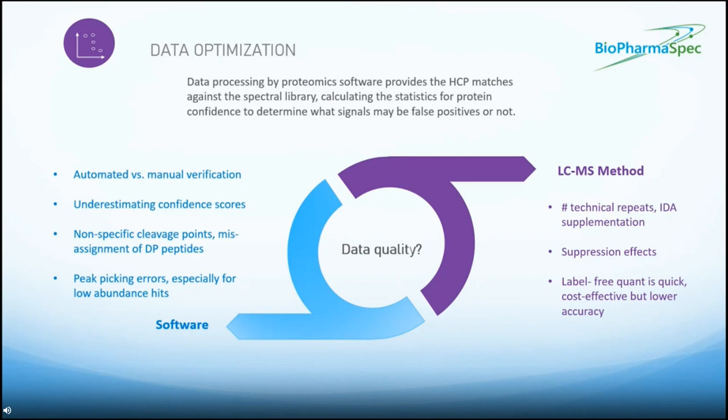And then a final point really to be aware of, as mentioned previously, is the accuracy of relative quantitation. It does have its limitations due to ionization differences between the spike standards that you've selected to help in the quantitation and then the actual HCPs themselves. So the peptide ionization efficiencies and responses will probably be different. And so a more accurate evaluation of the HCP amounts can be performed using an MS strategy, such as with heavy labeled isotope analogues of an HCP. And yeah, you can adopt this as a follow-up method.